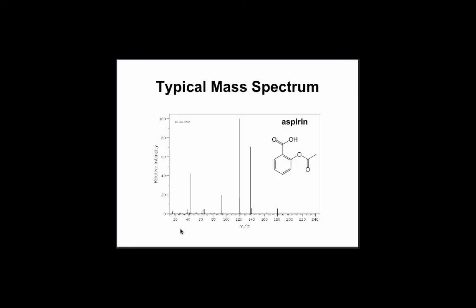So this is an example of a typical mass spectrum of a small molecule, aspirin. We can see a parent molecular weight of about 180 Daltons. And then we can see some fragments. This is likely a typical case of something that's gone through electron impact ionization or maybe an MSMS, where there are fragments that have broken up as well. They have different peaks. So the intensities of these peaks do not necessarily correspond to the abundance. In that respect, mass spectrometry is notoriously bad for measuring or quantifying things, unless you do some special tricks.